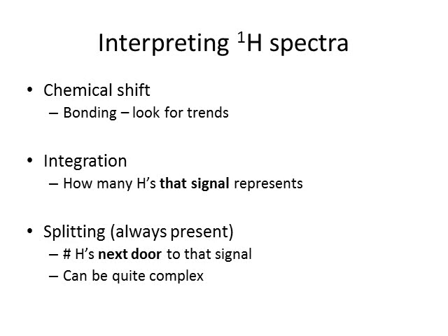Well, where those come along the x-axis is going to tell us about the molecule. It's going to tell us that those hydrogens are attached to sp2 or sp3 hybridized carbons. It'll tell us if there's strongly electronegative elements nearby. It'll tell us if they're attached to alkenes or aromatics, a variety of things.